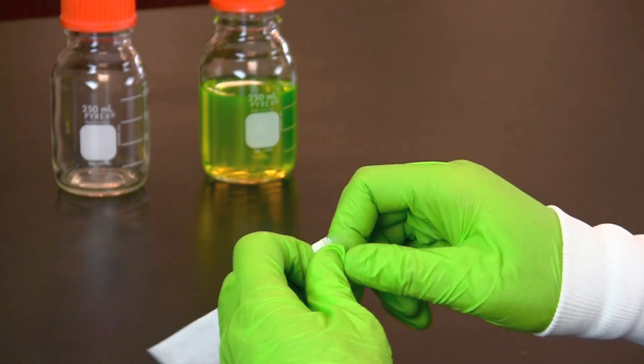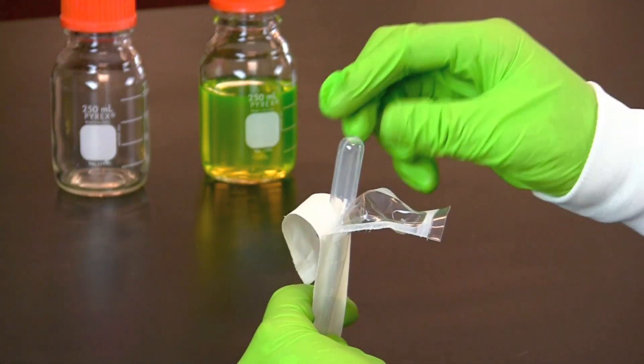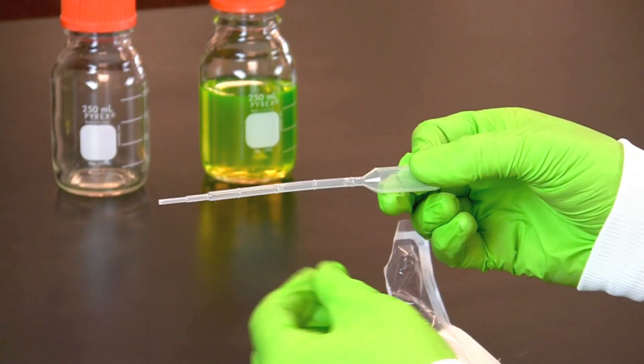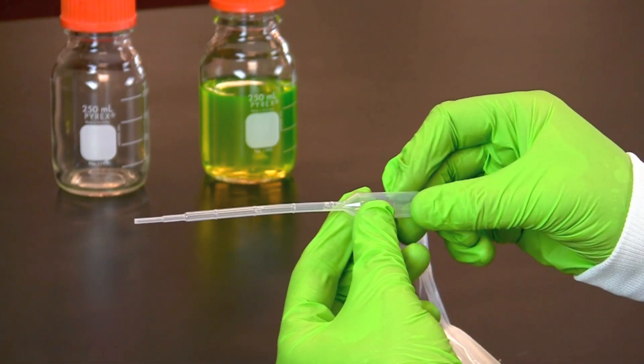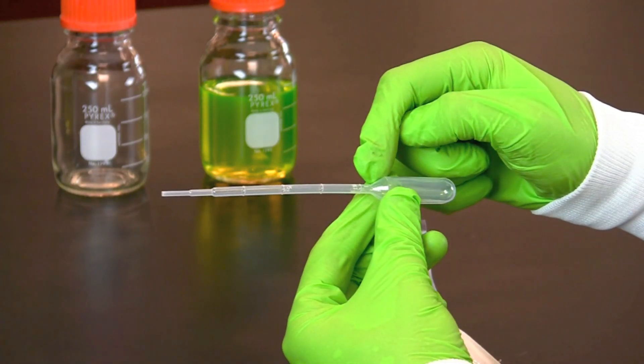Transfer pipettes are often available in individual sterilized packages for microbiological work. This is a 1 milliliter graduated disposable plastic transfer pipette. The pipette has a bulb that is connected to a shaft.